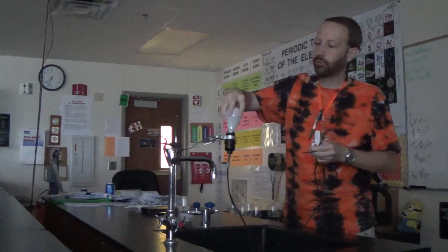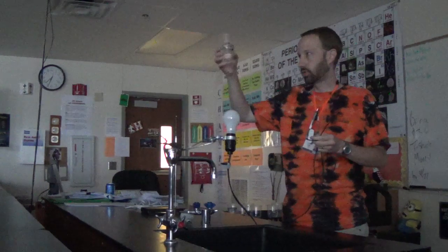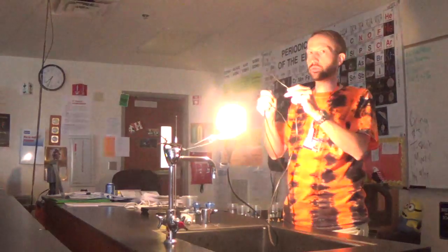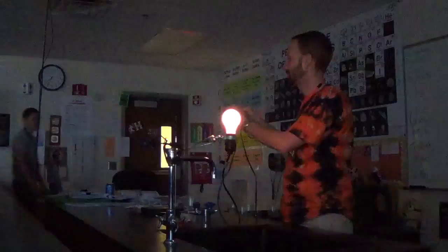So here is my 34 watt bulb. This cup represents my bathtub of distilled water. And the light bulb does work. And now as I stick the wires into the water, touch the wire. Go for it, come on. No, make the wires touch. It does work, but not in the water.